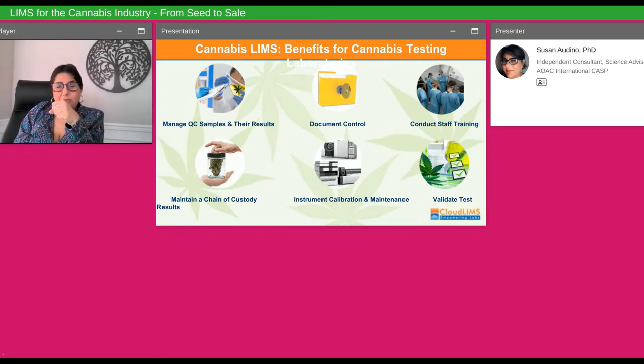Part of it involves a contract. Part of it involves an agreement between the lab and the customer to perform specific work. So there's a lot that goes on, and that chain of custody is necessary for continuity of services as well as for defensibility, legal defensibility. The lab is not able to perform work on a customer sample unless we know the history of that sample.